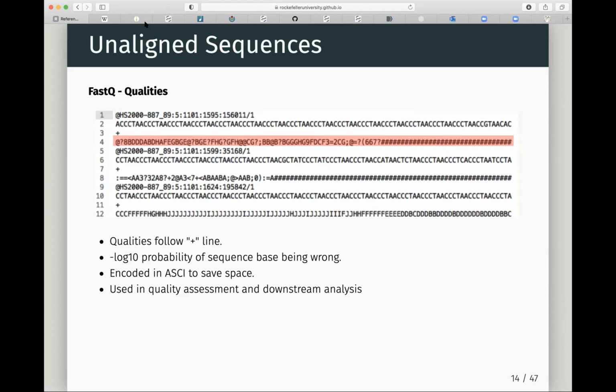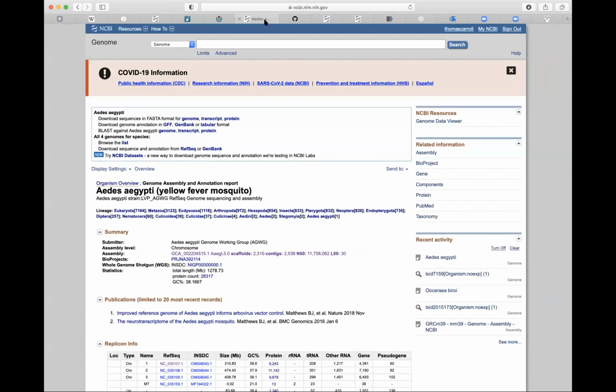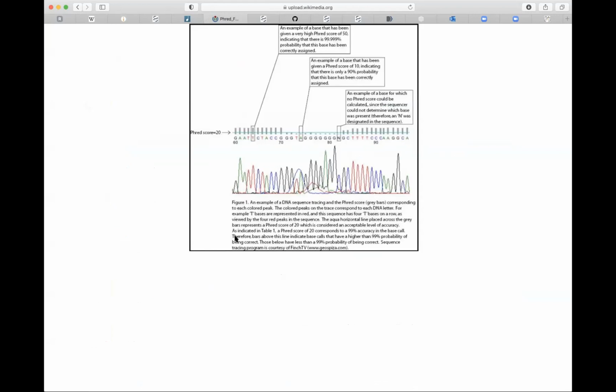And really it's derived from this picture here. This is a really lovely image of how this is done. If we look along the bottom, we have our colors, and I was saying that we have different fluorescence for different colors. This is working along a sequencing cycle, going from the beginning of the read that we're sequencing to the end. What we have here is the intensity of the fluorescence when we are looking at that particular spot on the flow cell, that particular sequence. At the beginning, we have quite black only, so we're pretty confident it's a G, and then we're confident it's an A, and T, T.